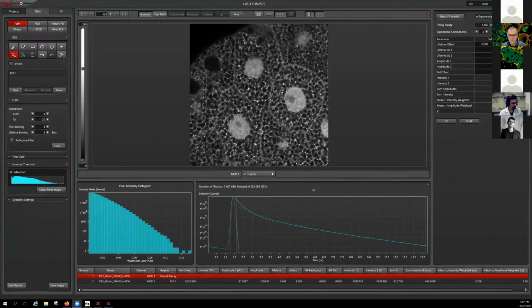Okay, after all of this talk, I would now like to put on some of our solutions. So it's Atto 425, and I would like to see the behavior of our system.